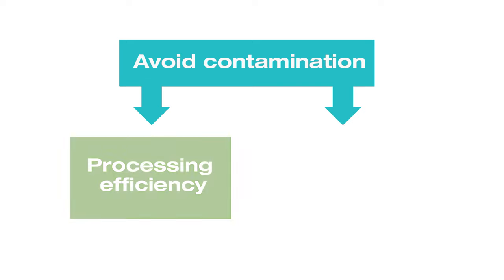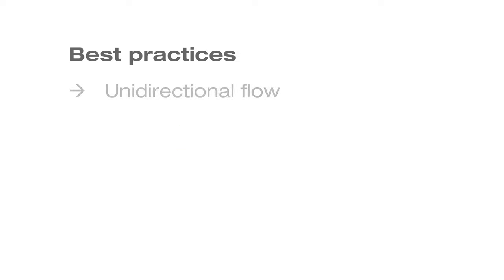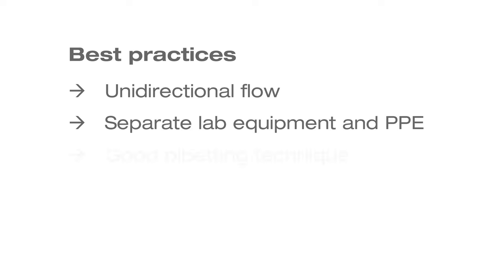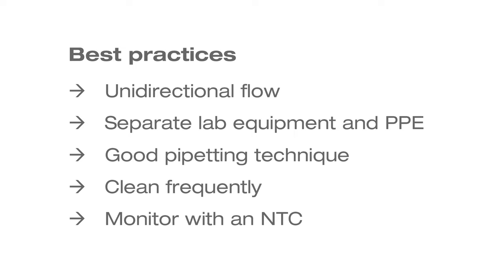Using the best practices we've highlighted in this video can help you avoid contamination in your lab, ensuring greater processing efficiency and robust data. Be sure to set up your lab to use unidirectional flow, separate lab equipment, and PPE. Focus on good lab technique when pipetting, handling samples, and using index adapters. Clean areas frequently, and monitor performance with an NTC. Following these tips will help prevent contamination in your lab, and the headaches that come with it. Happy sequencing, and as always, thanks for being part of the Illumina community.